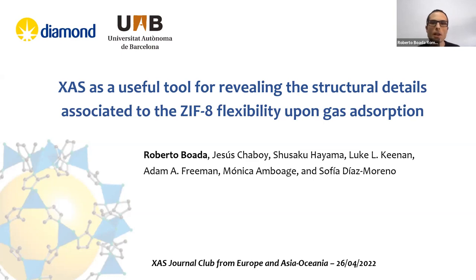So today I'm going to be showing you some of the results that I obtained when I was doing my postdoc at Diamond Light Source, and, as Hitoshi has said, at the Universitat Autònoma de Barcelona, doing some other things related to more environmental chemistry. But back there, I was doing gas adsorption studies on metal organic frameworks. In particular, I'm going to talk today about the flexibility behavior of one type of metal organic framework, called ZIF-8, and the structural changes that occur when we are loading gas, or going through a transition, through this flexibility behavior.